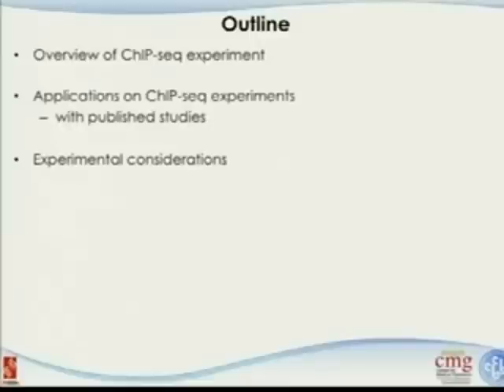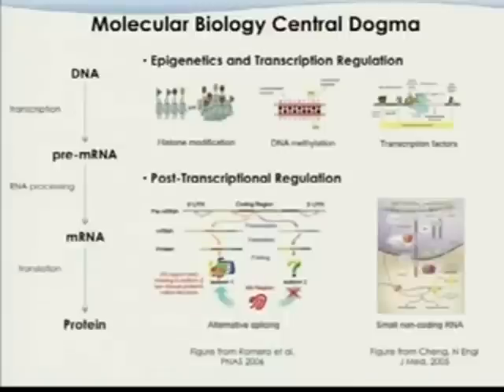Today we're talking about ChIP-seq. I will first give a very brief overview of the ChIP-seq experiment. Then, as usual, I'm going to present several applications using ChIP-seq. You'll be surprised that people are pretty creative in using this well-established methodology. And in the last couple of slides, I'm going to talk about experimental considerations.